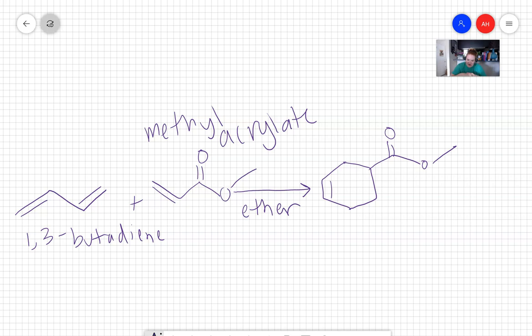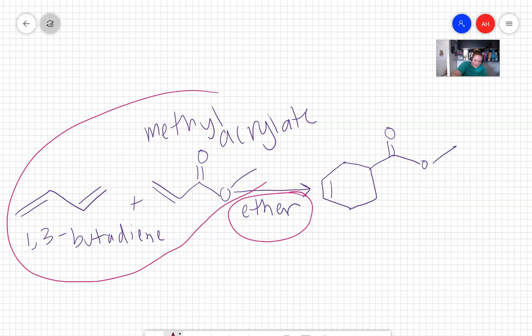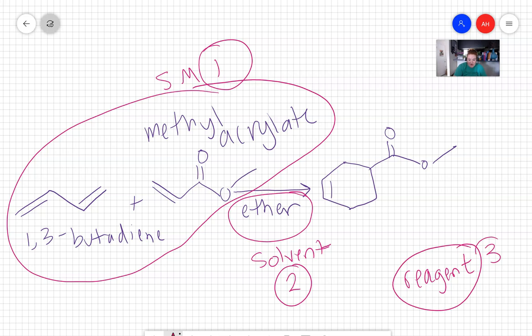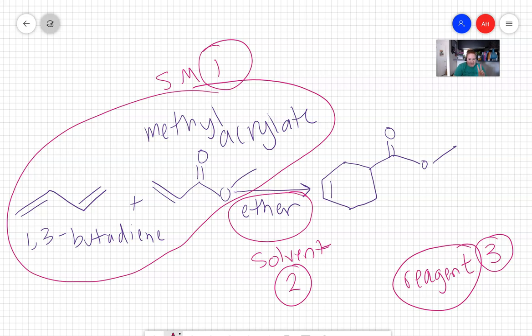And then go through the rest of the steps. One of the things I learned with troubleshooting with one of your classmates last week is that the solvent needs to be added in after the starting materials. So these are the starting materials, and we're going to add those in first. The solvent gets added in second, and then we don't have any extra reagents, but for experiments where we do, we add in the reagents third. For some reason, with the last lab, if you did the starting material and the solvent in the opposite order, it would explode your flask. So we figured that out with a little troubleshooting.